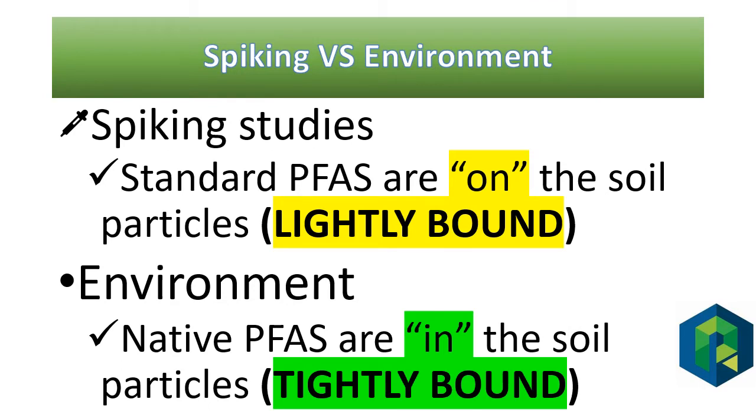However, there's a difference between PFAS that has been spiked into a sample and PFAS that has been weathered into the soil. And so one way to look at it is that the PFAS you spike into a sample are more like they're on the soil particles.